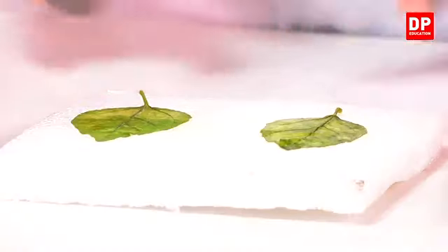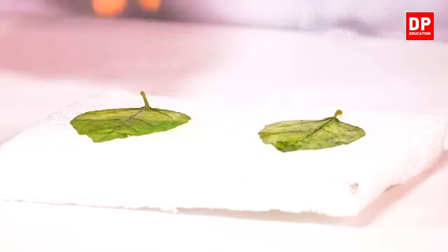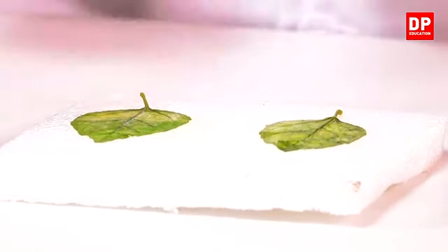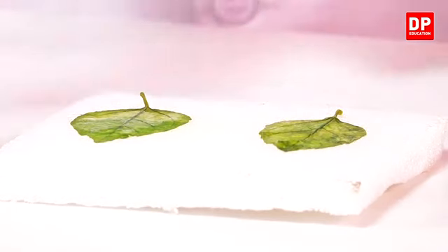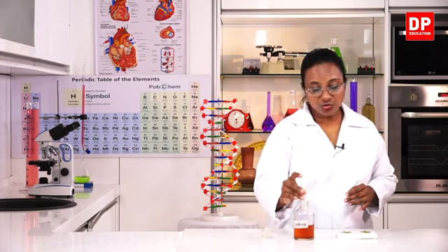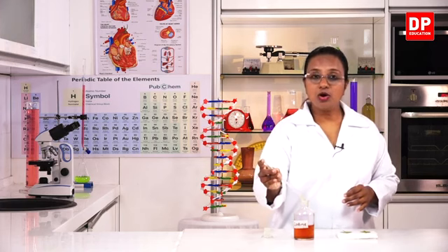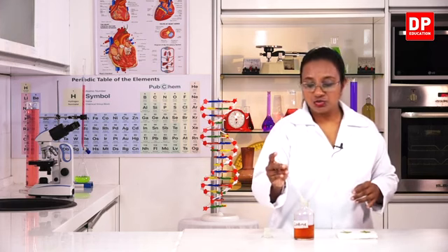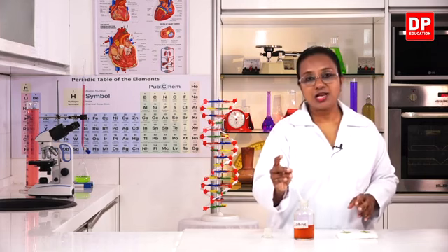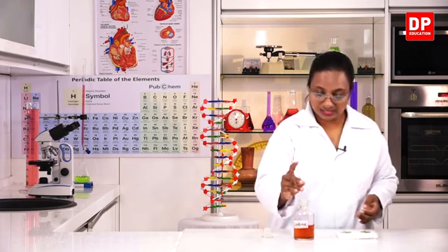After that, I have the 2 leaves here. This is the leaf that was covered in transparent polythene, and this is the leaf that was covered with black color polythene. Now, to both the leaves, I will put iodine. If starch is present, then you will see a color change. You know the color change. It has to become dark purple or dark blue. If there is no starch, then there will be no color change. And the presence of starch indicates that photosynthesis has taken place.